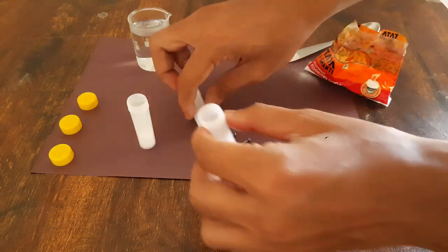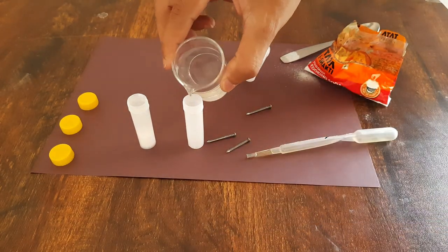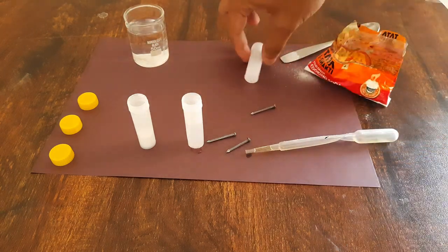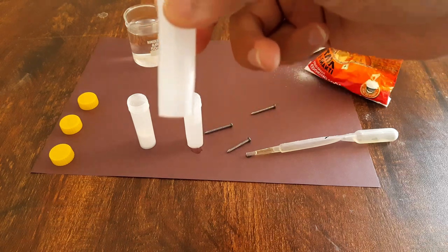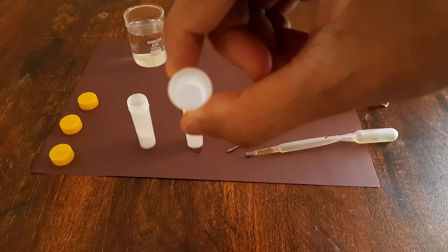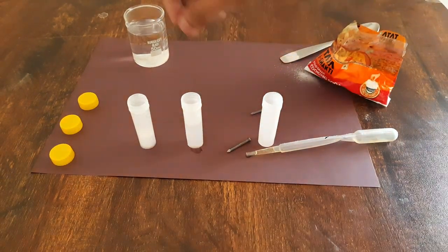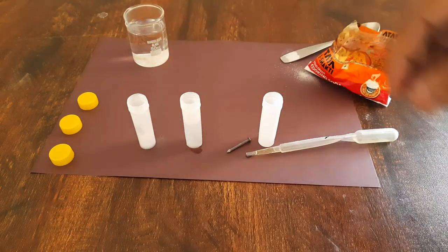Now we will add some boiled water in the second plastic tube. And in the third tube we have normal water, normal room temperature water. Now I will drop iron nails in each of these tubes.